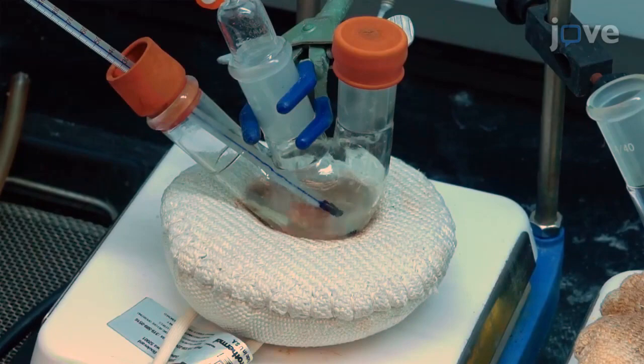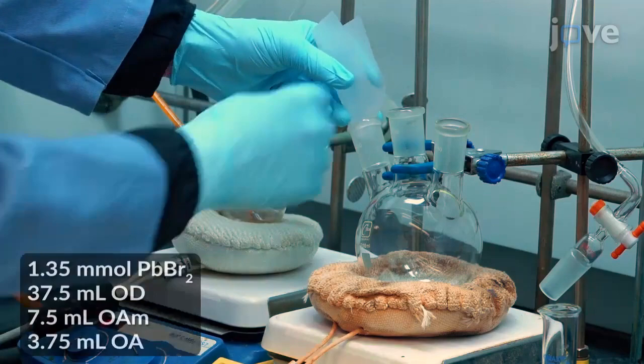To prepare the olelamine lead bromide precursor, add 1.35 millimoles of lead bromide, 37.5 milliliters of octodesin, 7.5 milliliters of olelamine, and 3.75 milliliters of oleic acid.